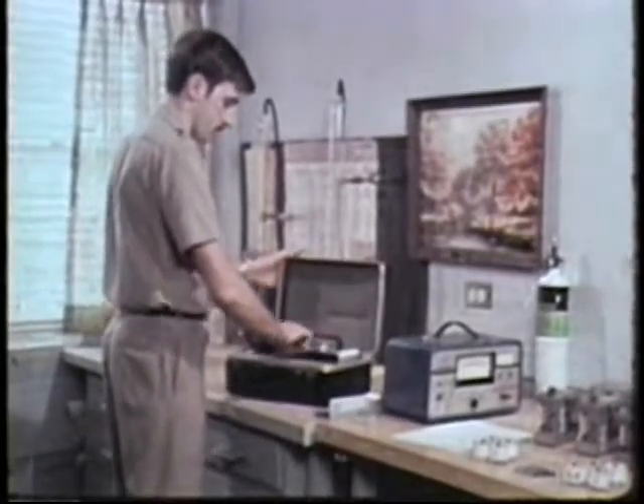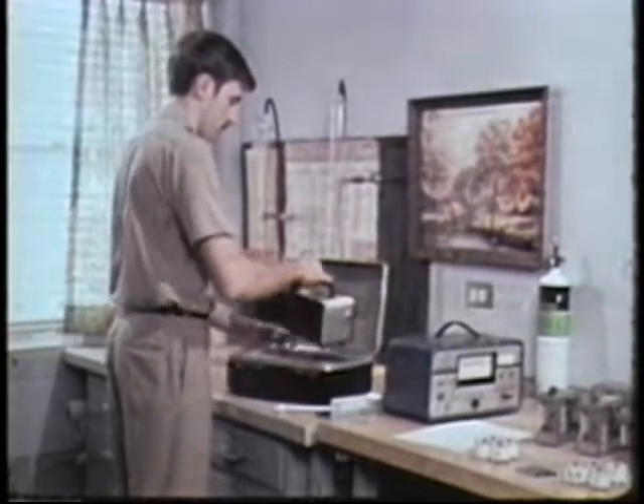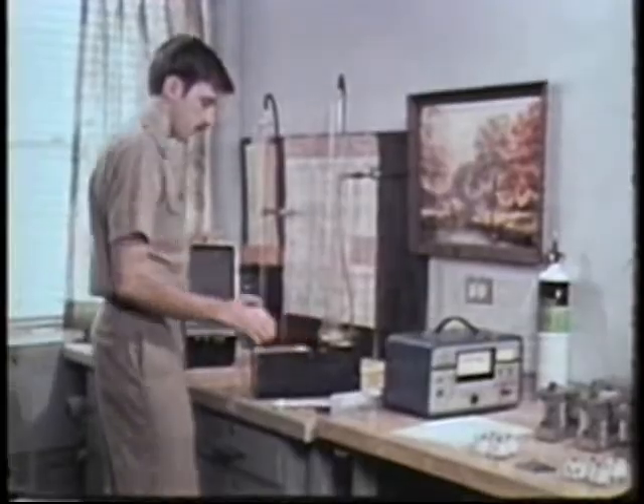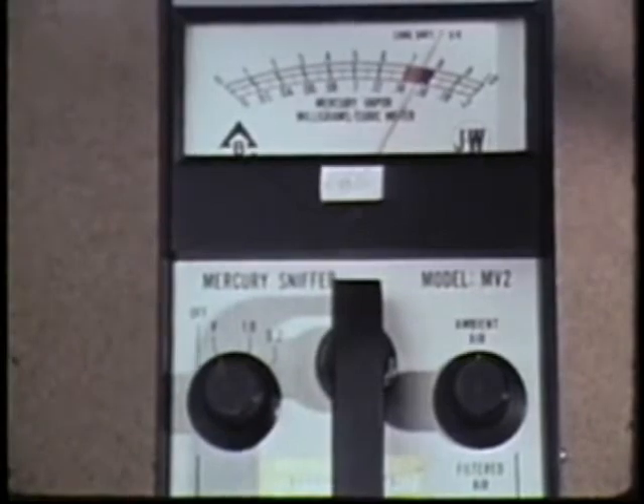Another instrument to be calibrated is the one you'll be using at the laboratory for detecting and measuring mercury vapor. To check the battery, switch to the V or voltage position. The needle should move above the red area.